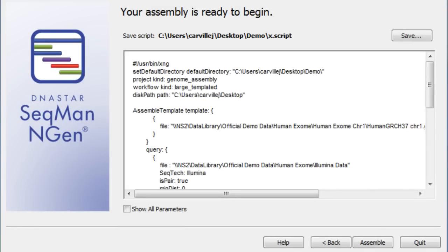Once you have added your data, you are ready to assemble your project by clicking on the Assemble button. SeqMan Engine uses a proprietary algorithm for assembly, which allows for assembly in regions of high variability from the reference, resulting in fewer gaps and greater depth.